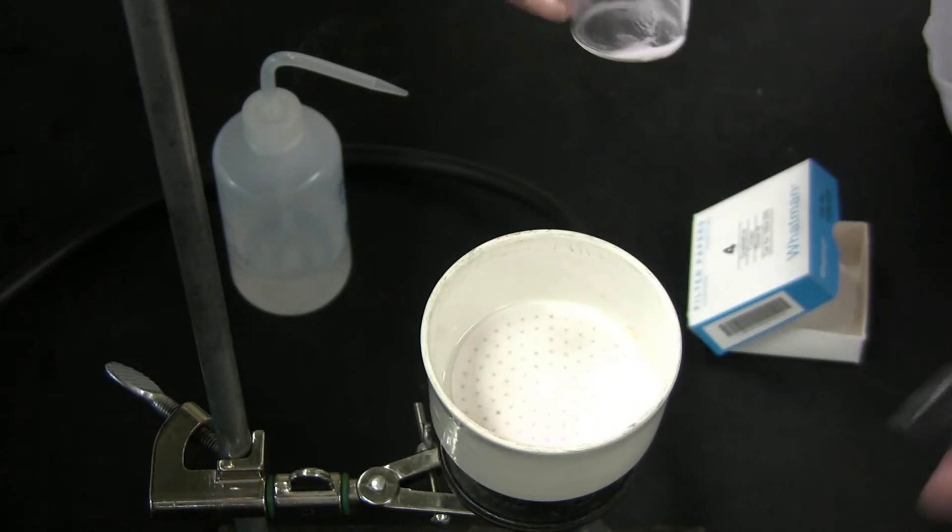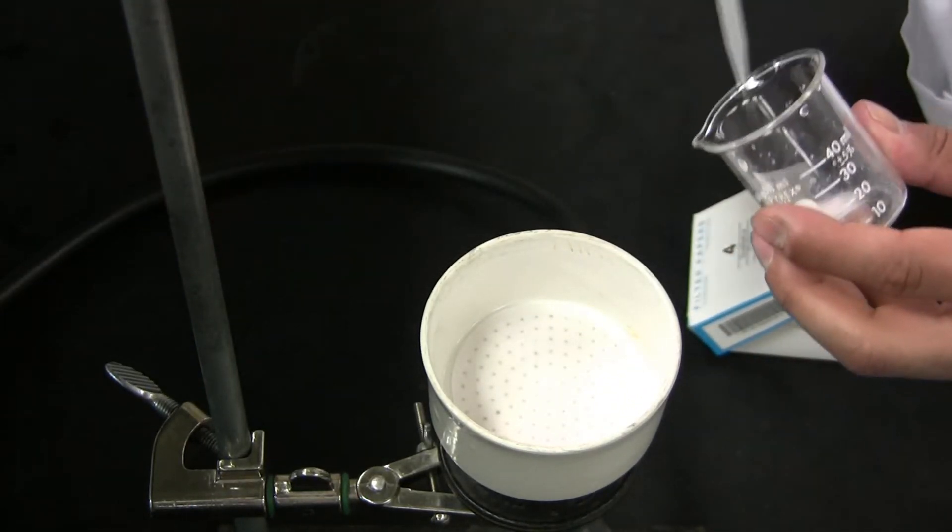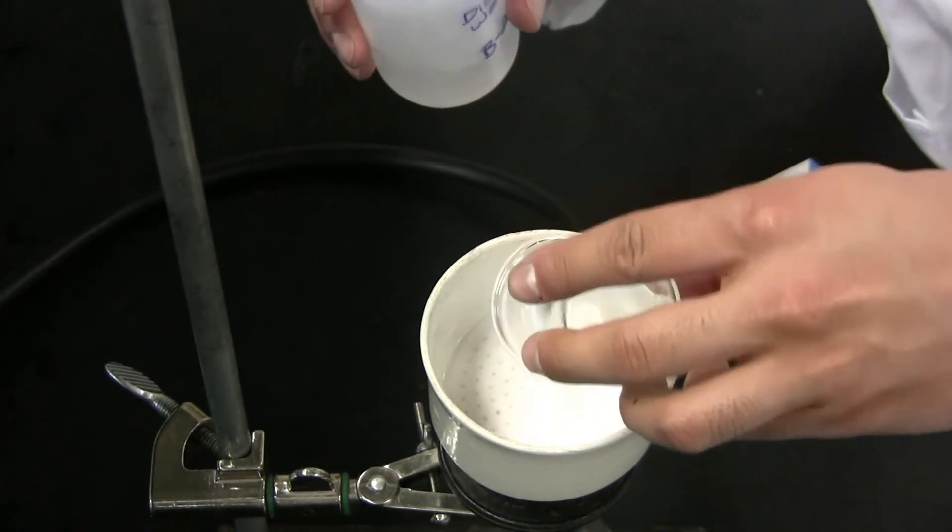For the remaining solids inside the beaker, add some of your solvent and then pour this gently into the Buchner funnel.